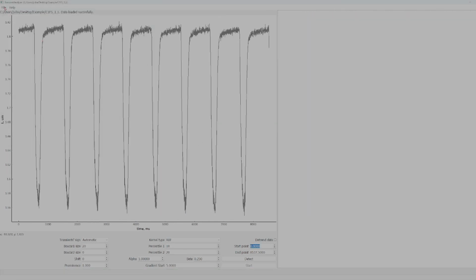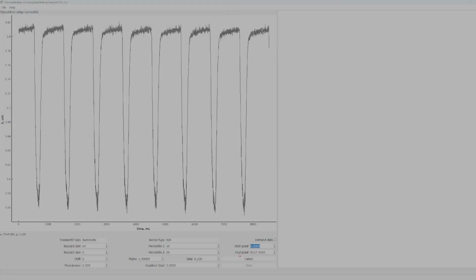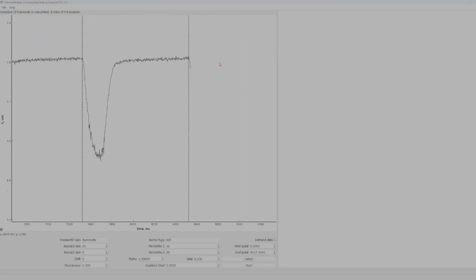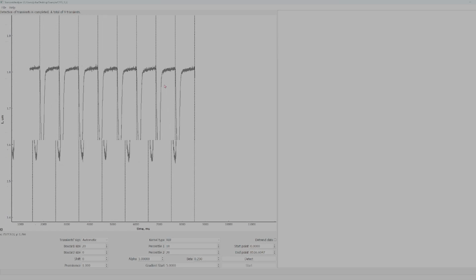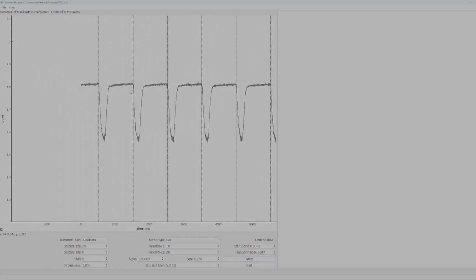It was this one, and then I choose add stimulation file, open, and then you need to press detect. And yes, of course it detects this one, but you can remove it just double pressing and again detect. Yeah, now it is not detected.